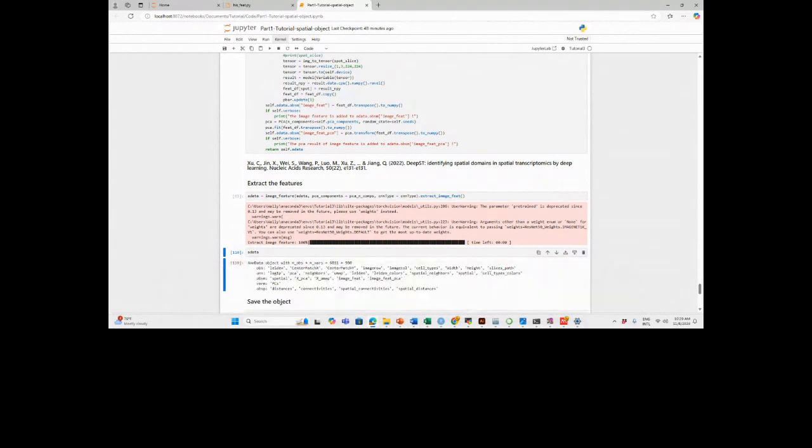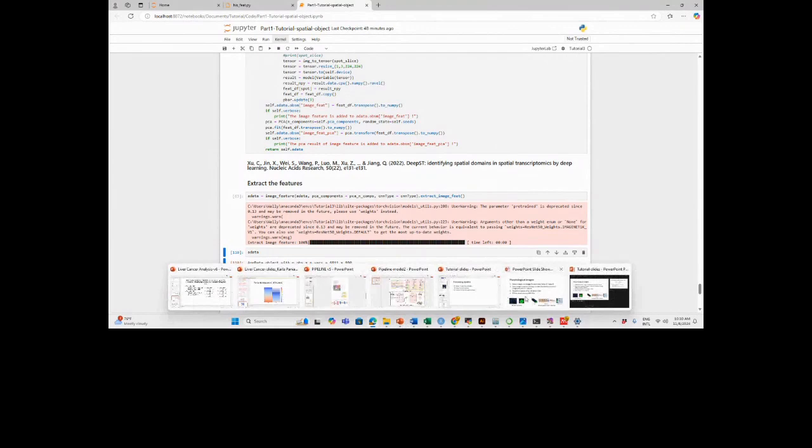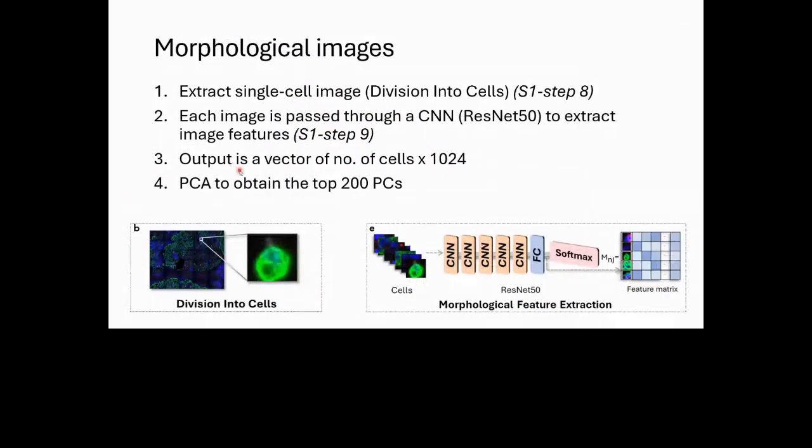Okay. Yes, you can find out exactly which transcripts are expressed by looking at the gene expression, or you can extract them for the individual cell. If you go to the, let me go back here.